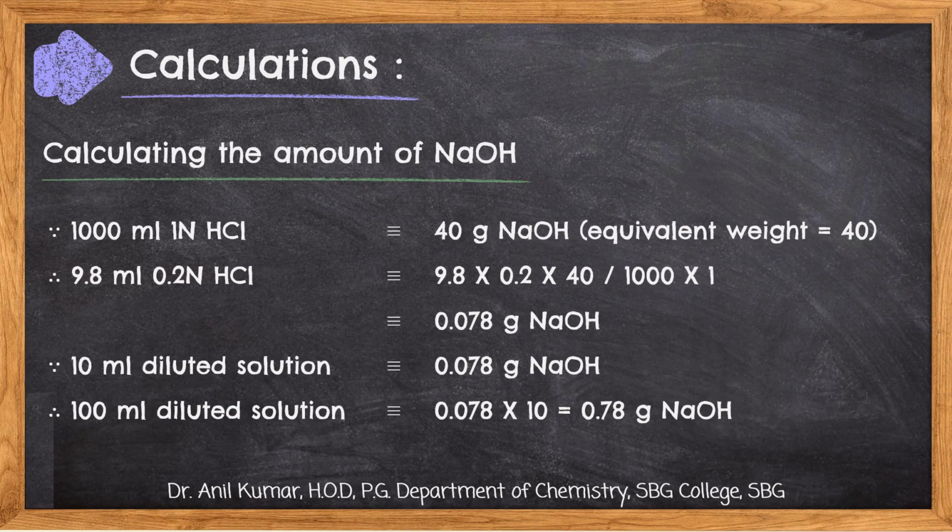When it comes orange and red, that is the end of the titration. Then after further calculation, we will calculate the different percentages of NaOH and Na2CO3. Drop by drop. We start the calculation.